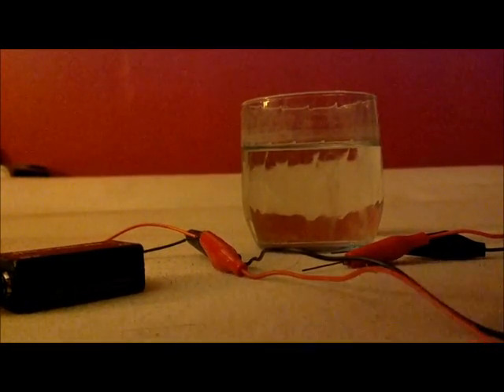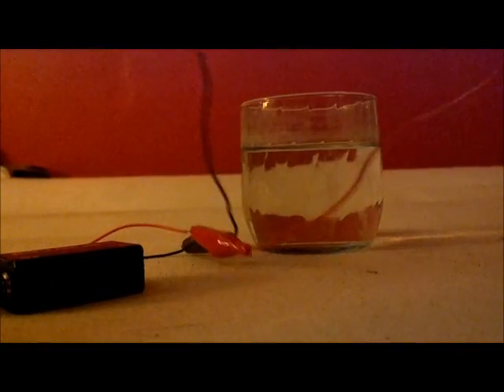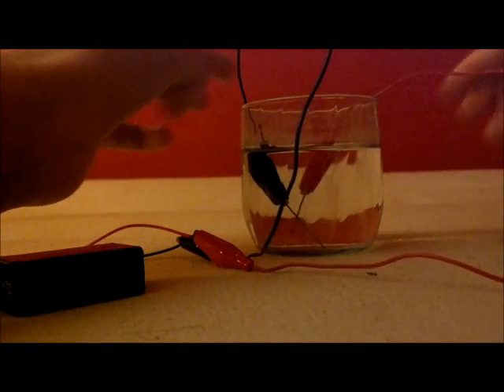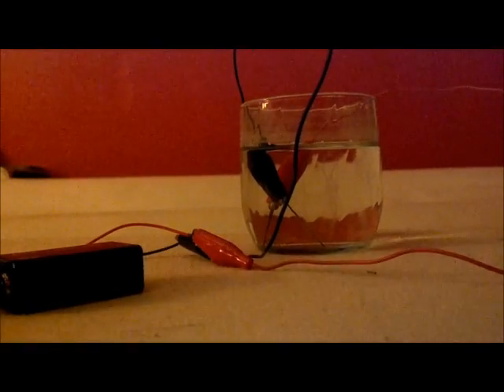Now what you're going to do is put these in the water — watch carefully — and don't let the electrodes touch, otherwise you won't get any gases at all.